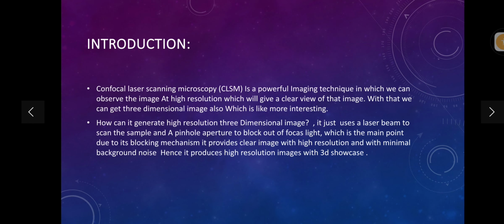This means we can understand that the high resolution image mainly depends upon the pinhole aperture because it blocks off-focus light and allows only focused light. So we can conclude that laser scanning microscopy gives a high resolution image.